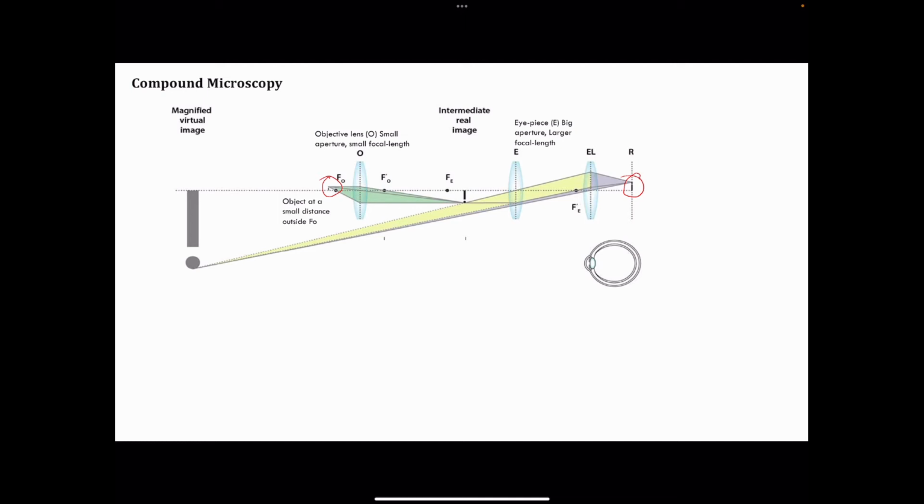In this illustration, the purpose was to show the light path or the optical trail which is followed between the collection of different lenses in your compound microscope. Now, if you have correctly understood how image formation takes place in compound microscopy, I would want to introduce another important concept here. But before that, if you have any doubt in this, go back and rewind this video and get this concept thoroughly as to how an image is formed eventually on your retina by using a compound microscopy like setup of these lenses.